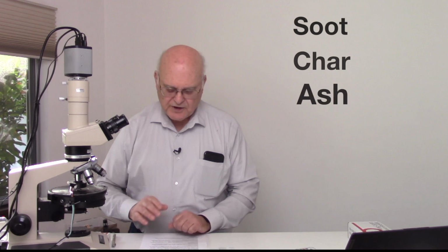We'll take a look at these three types of materials and see how we analyze them and what they tell you about the environment. Can you really tell the difference between a wildfire smoke event and that you might have from a house fire or an industrial fire or a fire in your backyard or fireplace? And the fact is, yes, you can very easily. But we'll take a look at that.